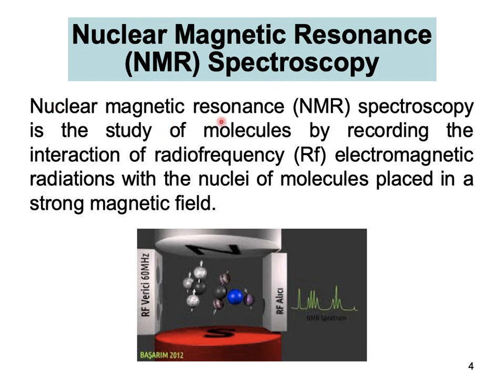It is the study of molecules by recording the interaction of radio frequency electromagnetic radiation with the nuclei of the molecule, which is placed in a strong magnetic field.